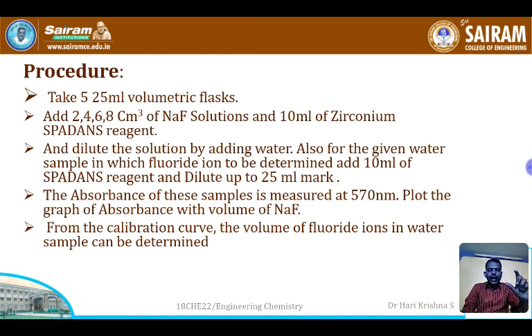Next, take volumetric flask 2, take the solution, check the absorbance. Again, take volumetric flask 4, check the absorbance. Take 6, check the absorbance. Check 8, check the absorbance. Then take the volumetric flask named as test solution and check the absorbance.